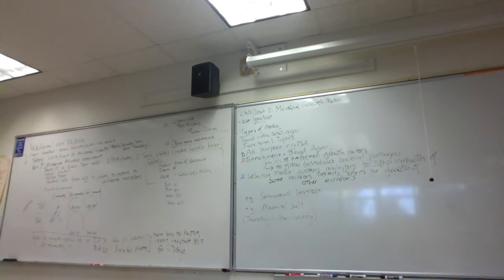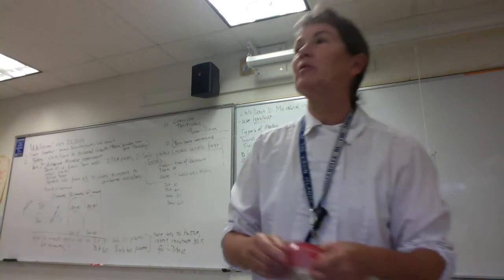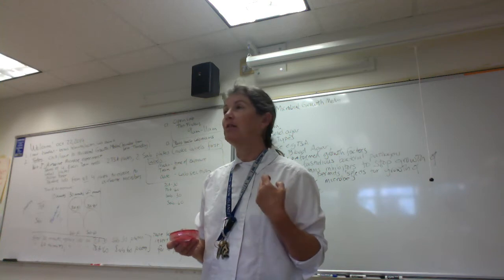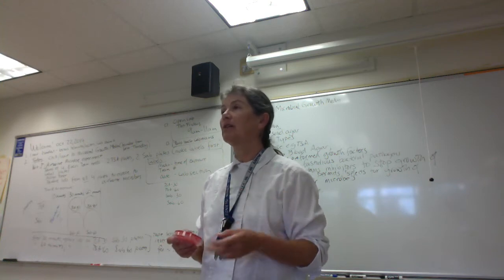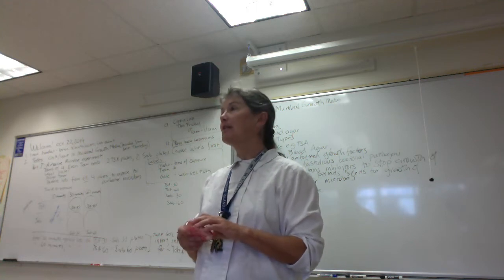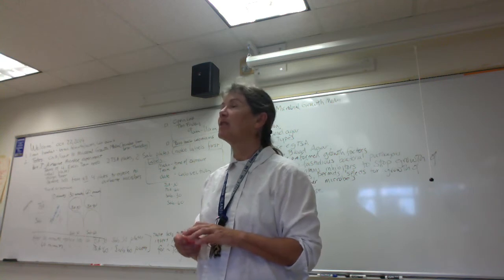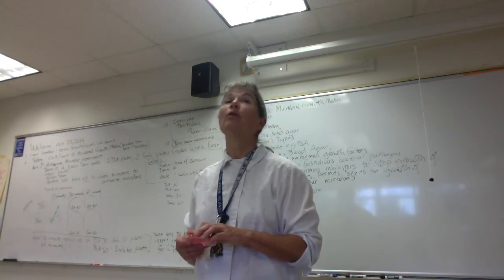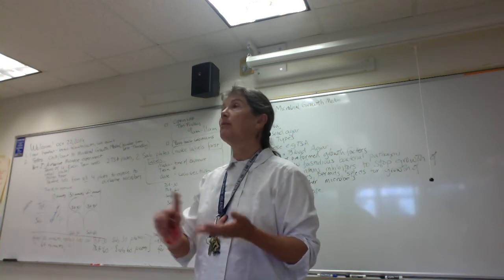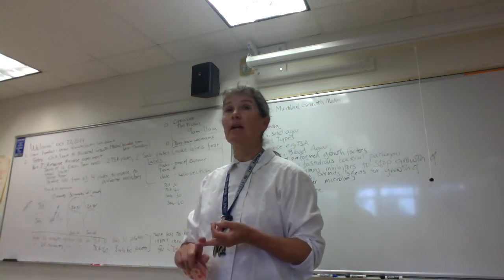Bright red, yeah, right? So you guys, you might say, well, why would you add blood to an all-purpose medium like TSA? Well, the reason is that many of the pathogens that infect your patients or infect other animals are what we call fastidious pathogens. And fastidious pathogens can't make a lot of things by themselves. We say they have a need for growth factors, so they need pre-made amino acids, pre-made precursors to nucleotides. They need lots of vitamins, right?